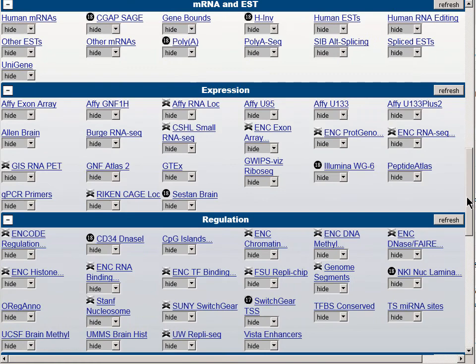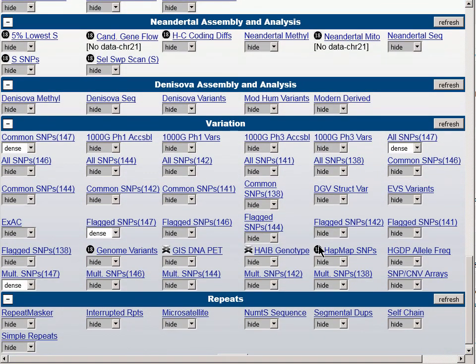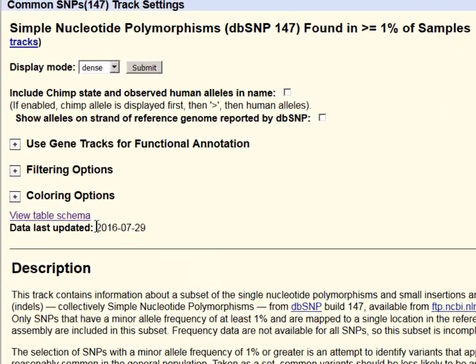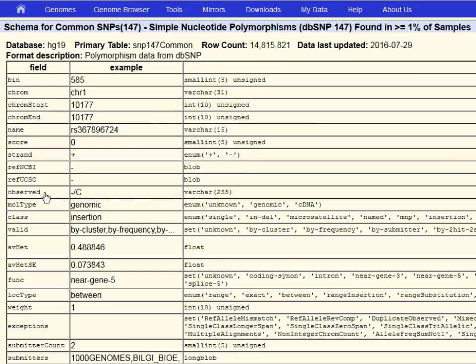Let's scroll back down to the bottom of the screen and look at the common SNPs configuration page. If we click into the link above the pull-down menu, we see first of all that this is a 2016 July release. Clicking into the table schema link, we can learn how many variants there are in the table — nearly 15 million.